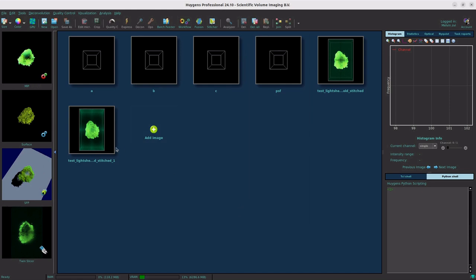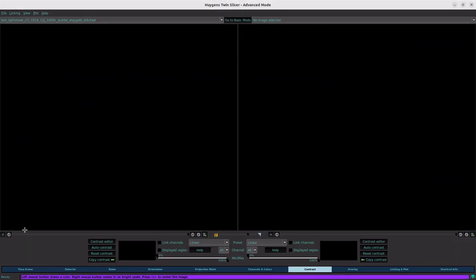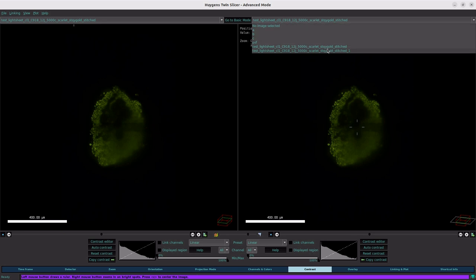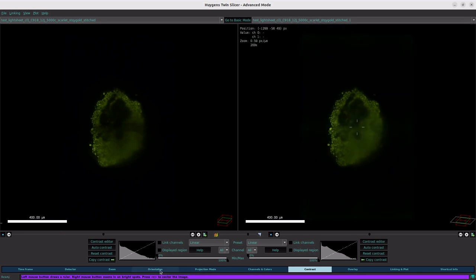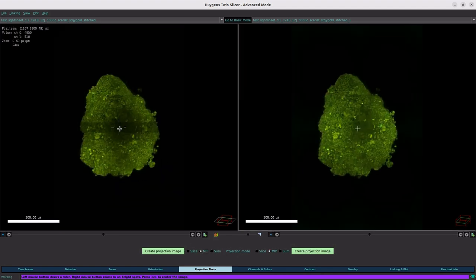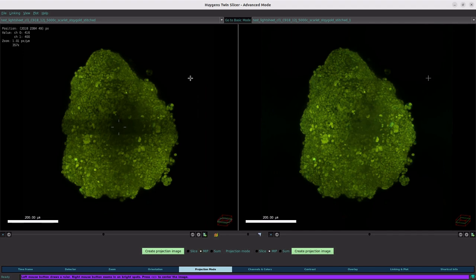By pressing down, the image will be opened in the Huygens main window, and we can then compare the result obtained with the normal stitching in Huygens with the one where we applied vignetting correction. And as you can see, as already presented in the webinar, you can obtain a good vignetting correction with the new estimation model, even if your stitched image contains only 4 tiles.